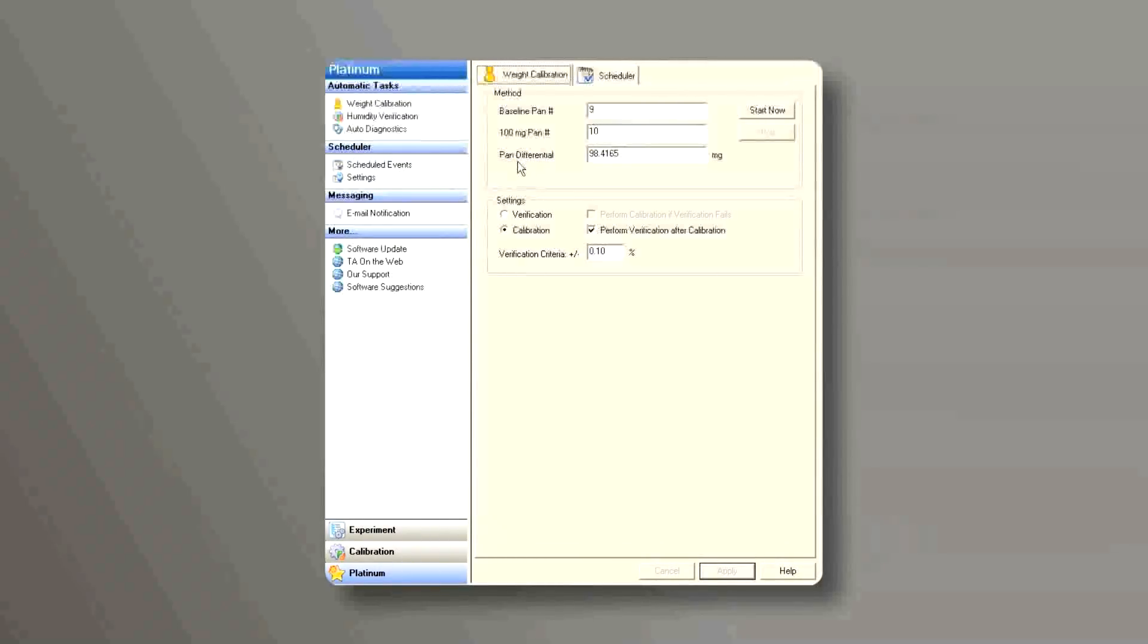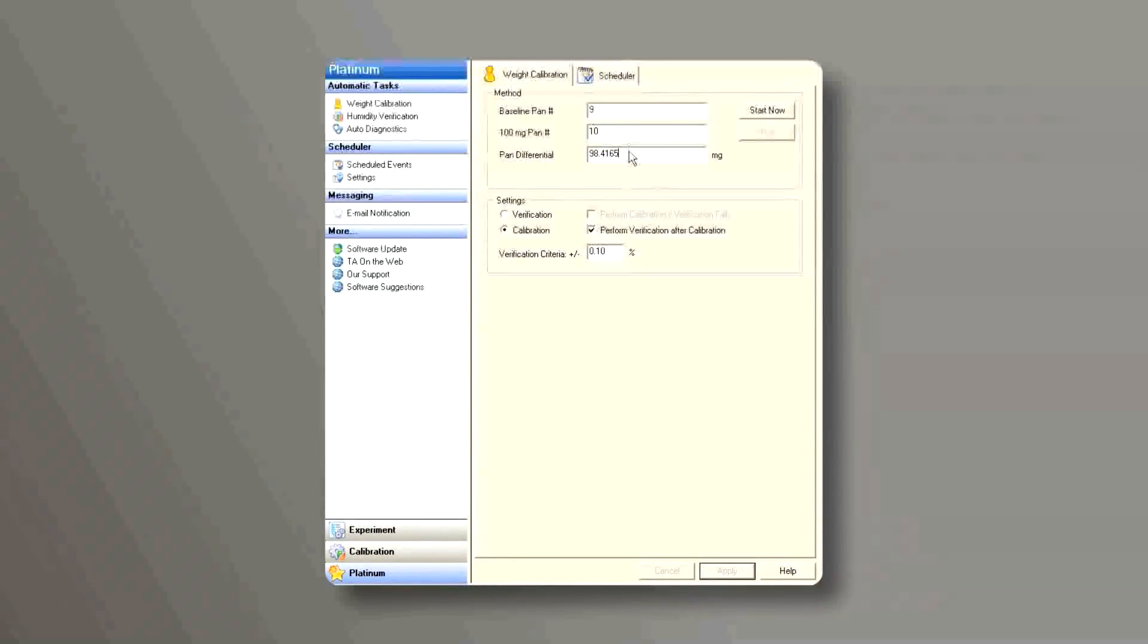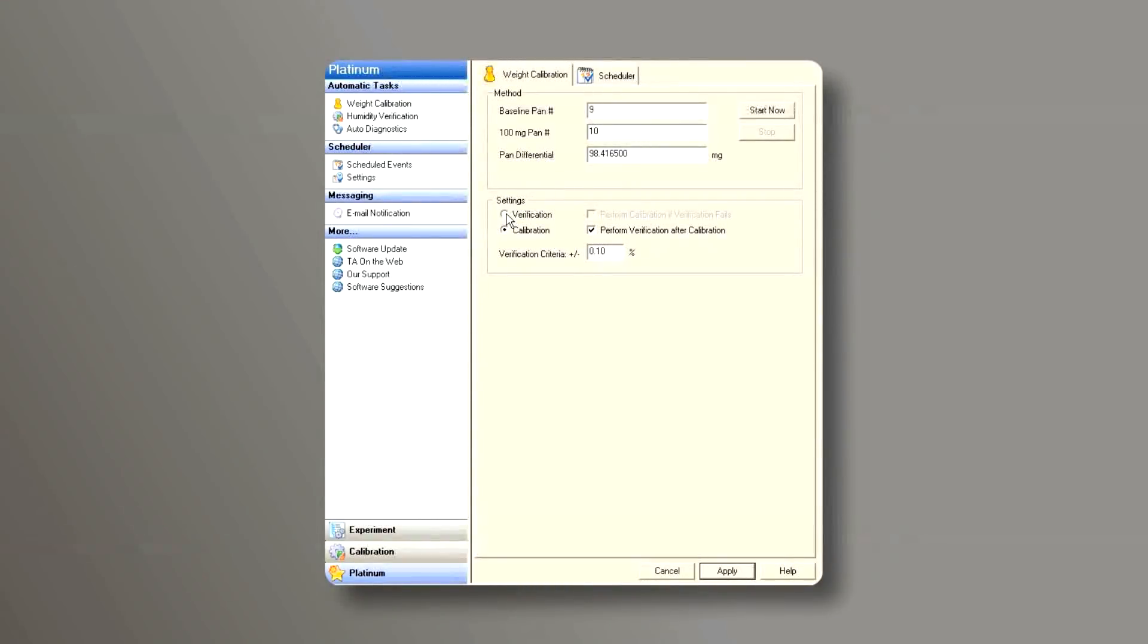Also, we need to input the pen differential weight, which is located on the bottom of the box. It is 98.41650 mg.